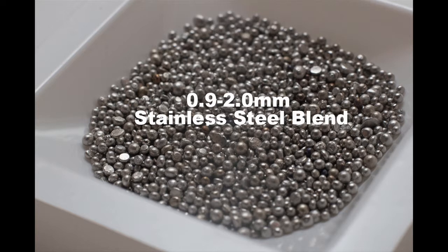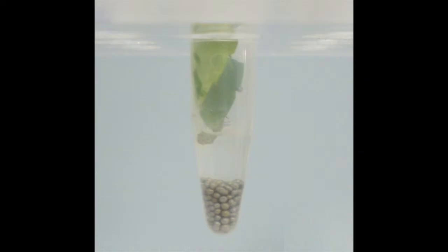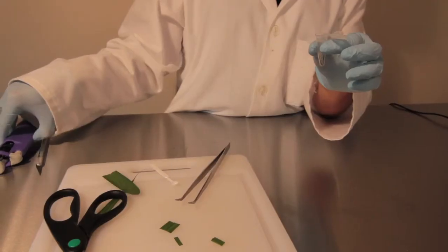Stainless steel beads cut through fibrous tissue, and their density helps to prevent the sample from flying up and sticking to the sides of the tube. Add a volume of beads equal to or greater than your sample.